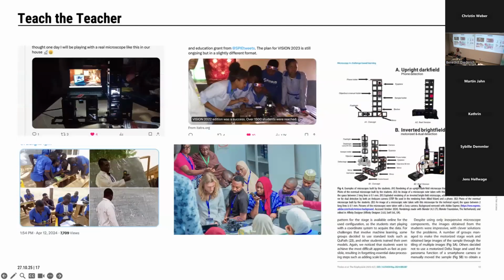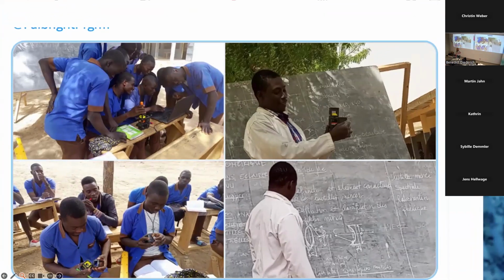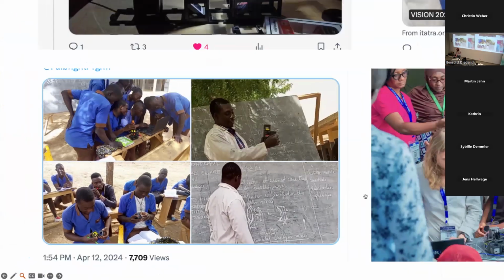With this, over the last few years, we have been part of many different initiatives worldwide where we taught how to use optics, or how you can use optics for your protocol. There are also some nice stories where people in, I think, Ghana used them somewhere close to the desert, in a context I've never experienced. So it was even in French. They taught how to design optics with our systems, which was quite nice.